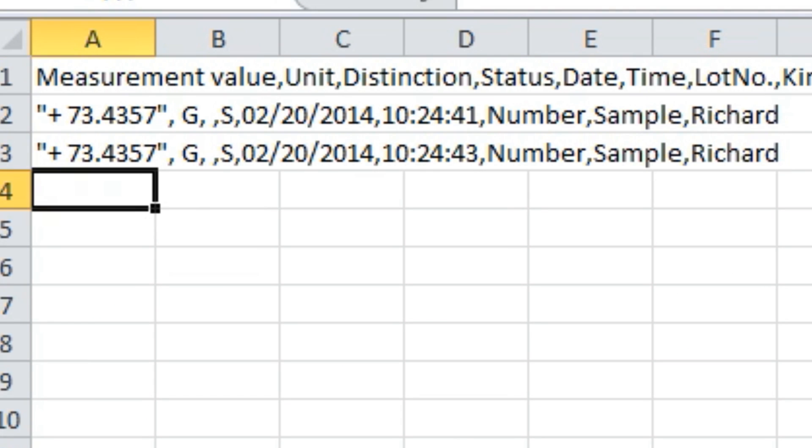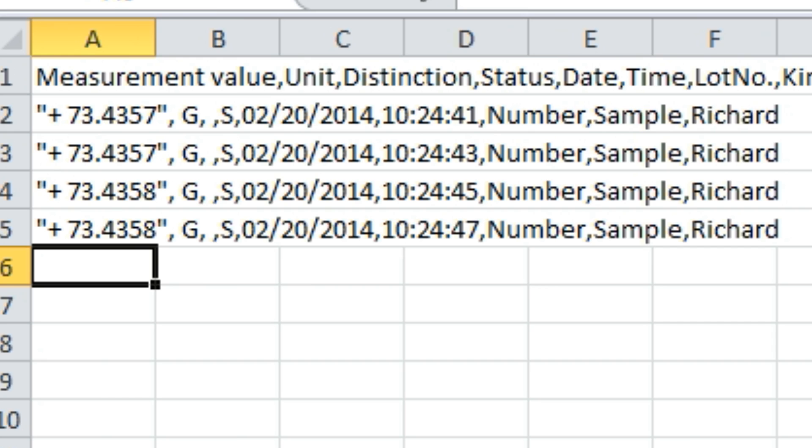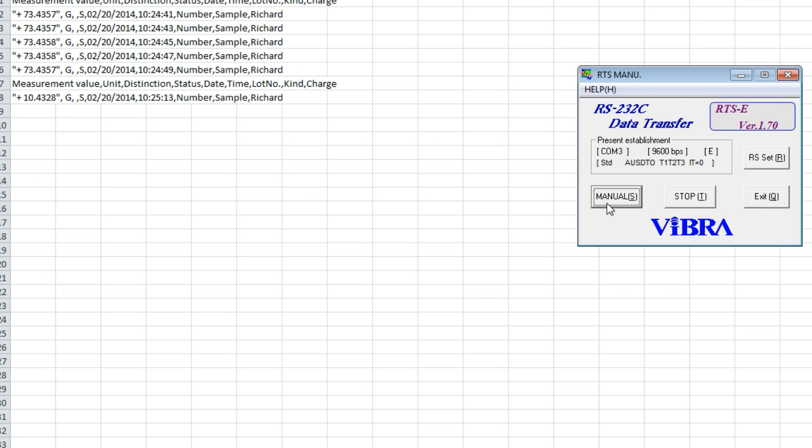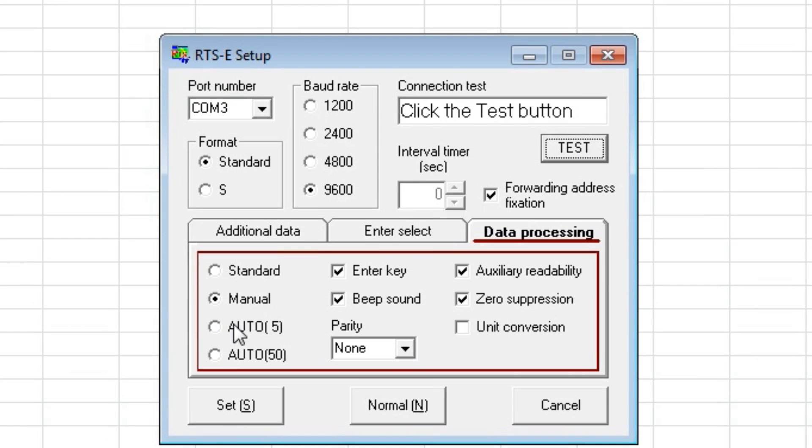Weighing data can be recorded at set intervals, manually, or can be set to automatically record when the balance reaches stability past a threshold of 5 grams or 50 grams.